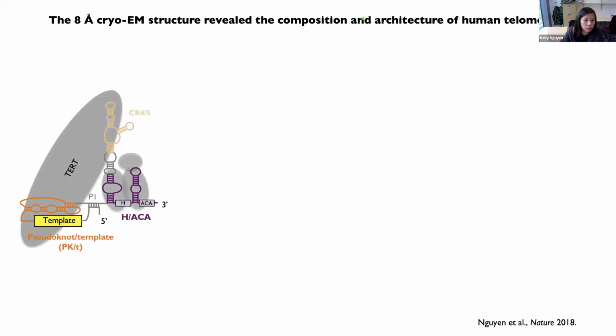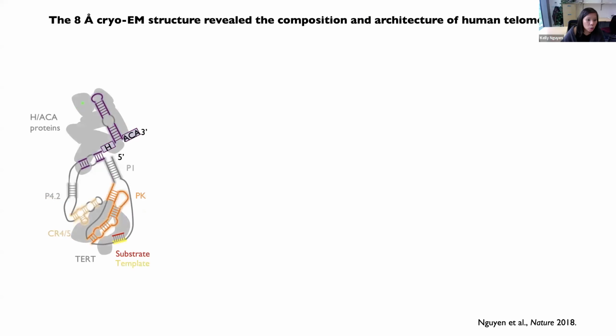I'm going to start with something that everyone has seen on the previous slide, which was proposed for human telomerase, and then turn to what we see in the three-dimensional structure as shown here. Perhaps for me, one of the most remarkable things when I see the structure is that the whole structure is scaffolded by telomerase RNA, which is shown in different colors here. And the proteins kind of stick together via the RNA, a lot of them.